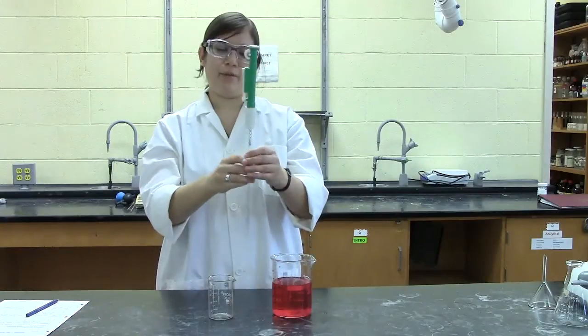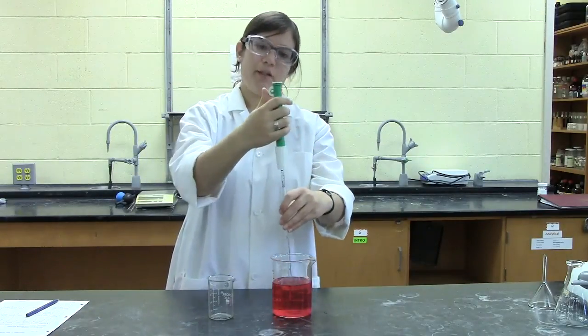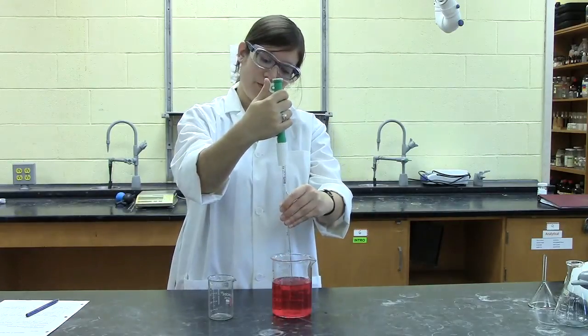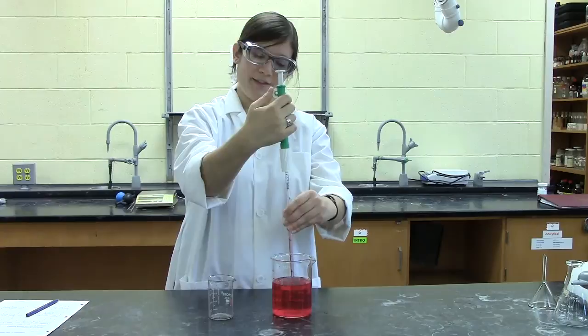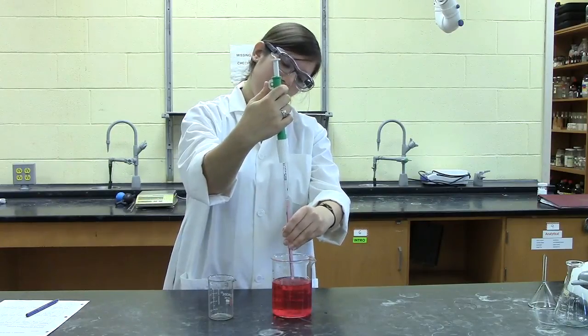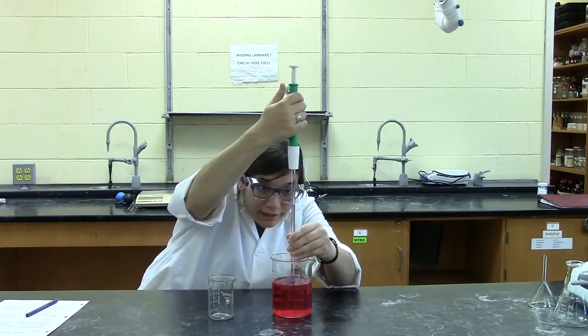The last type of volume measuring device we have is the measuring pipette, which can be used in two different ways. The first method is to use this wheel to draw the solution all the way up to the zero mark, which, like the burette, is at the top, not the bottom of the pipette. Make sure you read from the bottom of the meniscus at eye level.